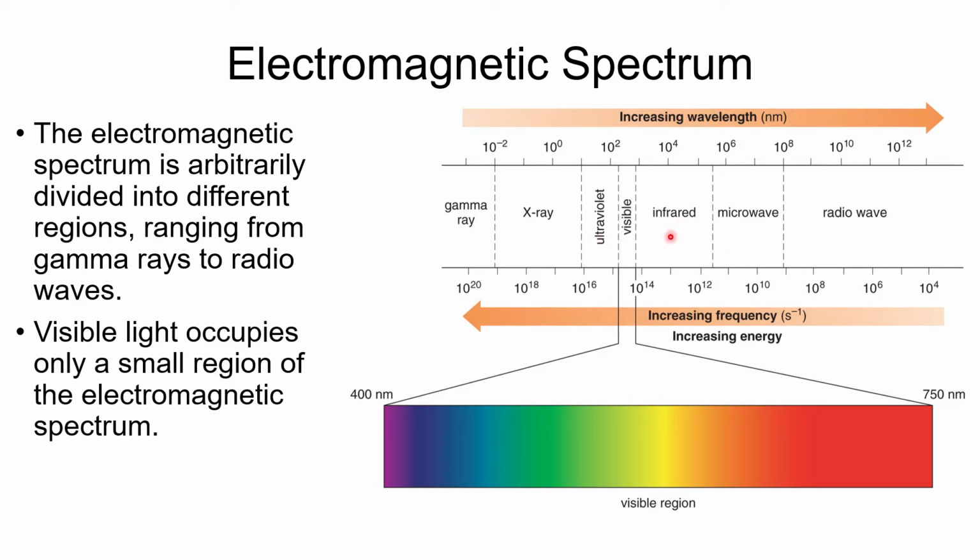Let's get over to the infrared. The frequencies here correspond to the frequencies at which bonds in molecules vibrate back and forth, and bend and stretch. It turns out that it's really useful for looking at the types of bonds that you have in your molecule, and that's what we're going to be looking at.